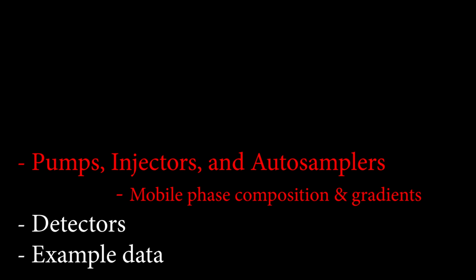The pumps are going to be what you're going to use to apply the pressure to push the solvent through. The injectors, because you got to get the sample in the system. And then we'll also spend a good amount of time talking about mobile phase composition and gradients.